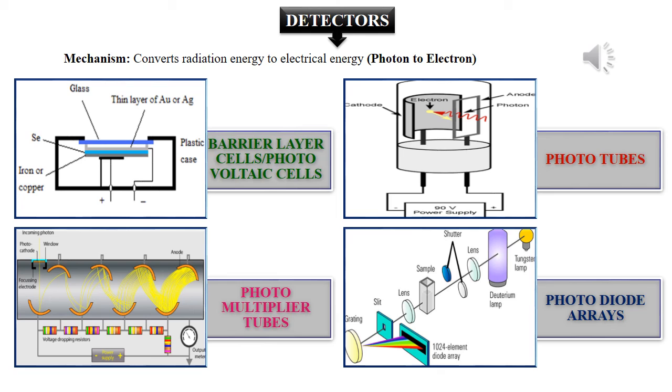And then this electrical signal is passed to the recorder. There you will get your spectrum recorded. That spectrum tells about how much concentration of sample was there in your prepared diluted solution. The solution has absorbing species, that is the chromophore, which absorbs the radiation. After absorption, some amount of radiation is received by the cathode. This intensity of radiation is converted to electrical energy by means of detectors. Then the electrical signal is passed to the recorder to record the spectrum.